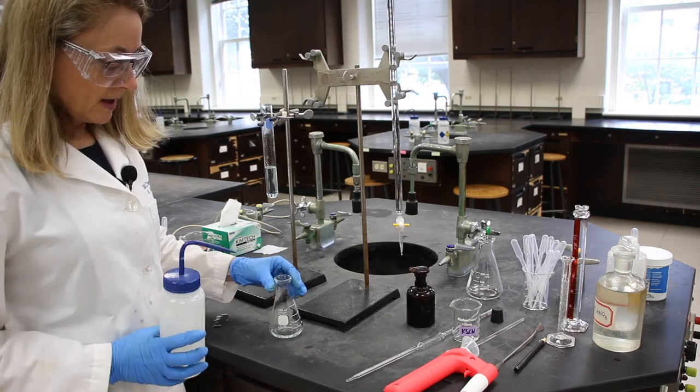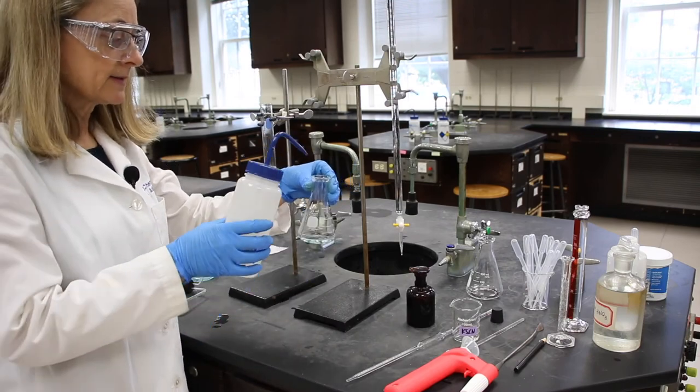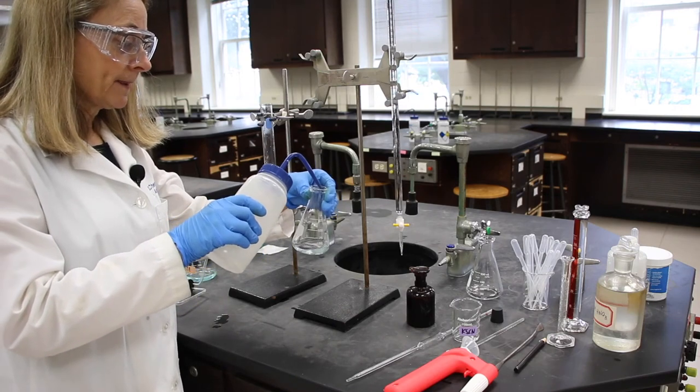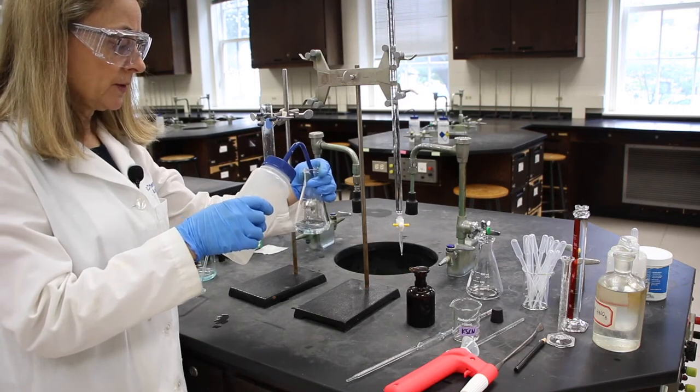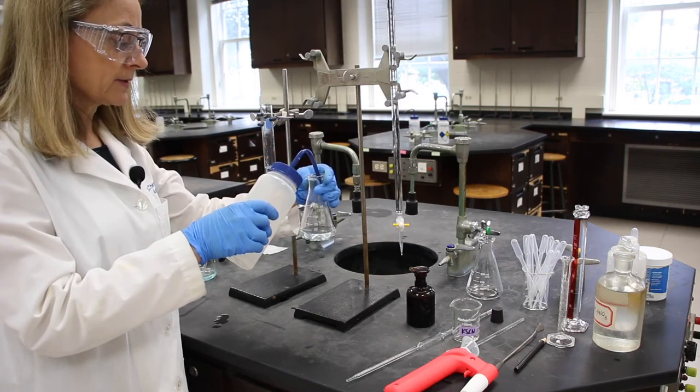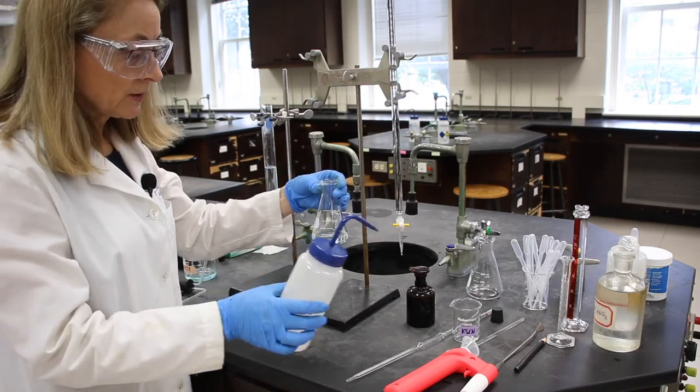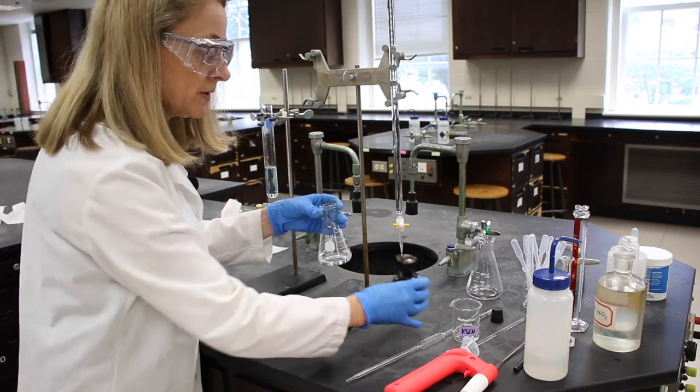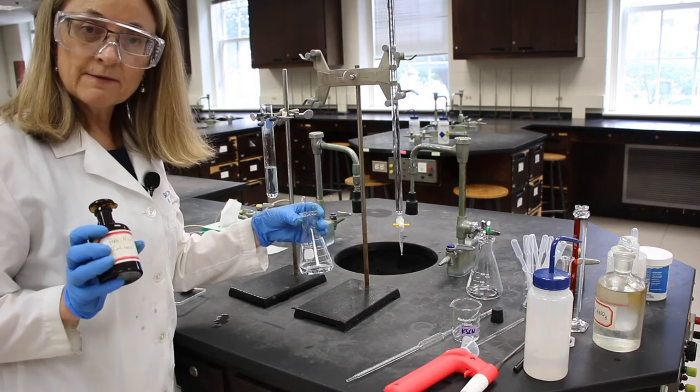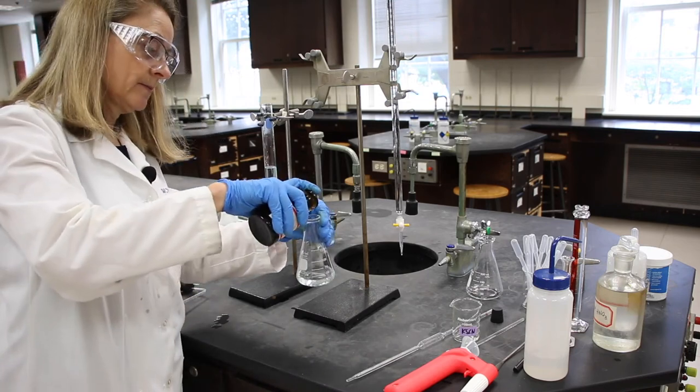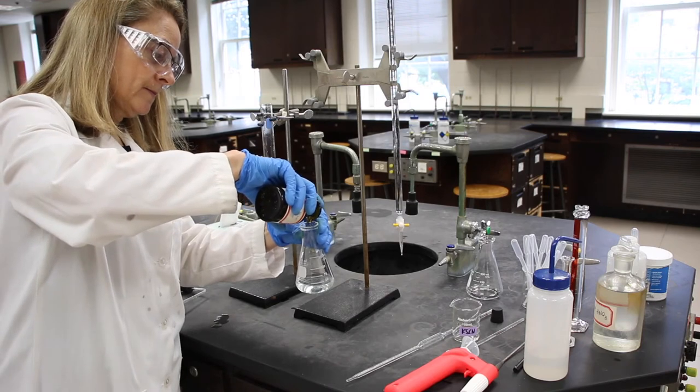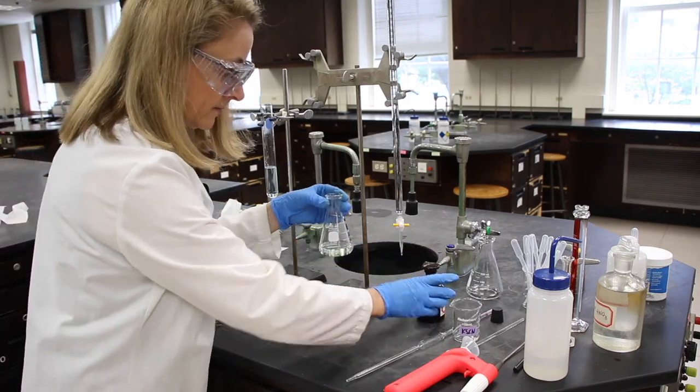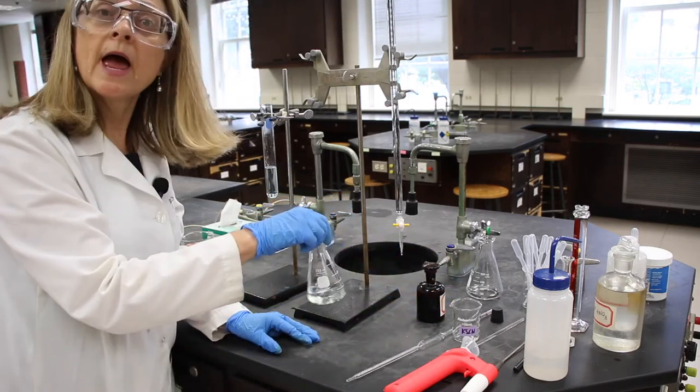Now that I've added my sample to the Erlenmeyer flask, I'm going to bring up my volume using DI water in the Erlenmeyer flask to, oh, between about 25 milliliters. It's not terribly important. We just need to have enough volume so that we can see a color change. I'm also going to add 15 drops of the ferric alum indicator. And I'll give it a swirl and now I'm ready to titrate.